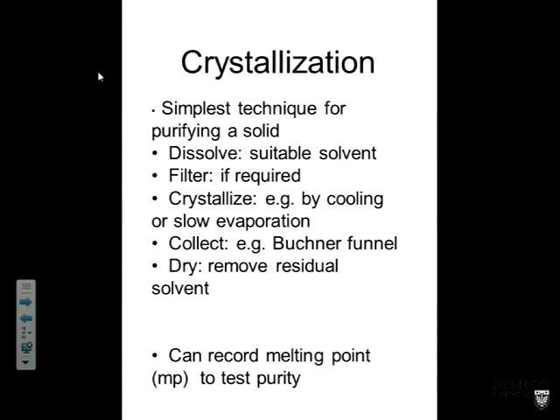And so as we cool our saturated hot solution, as it cools down, the solubility of the compound decreases. And your chemical compound will form crystals, and that will give you purification because small traces of impurity will not be saturated, and they will remain in solution. So slow, gentle crystallization of an organic compound.